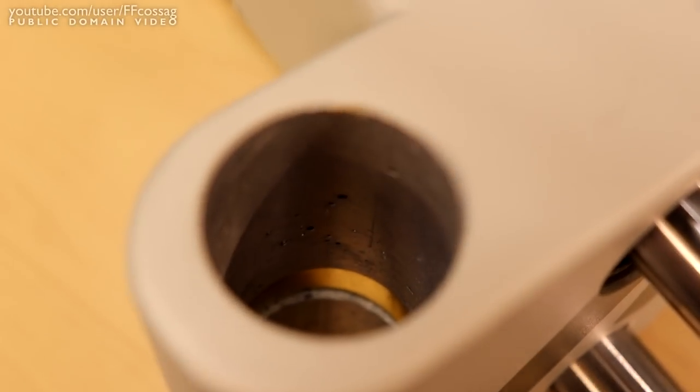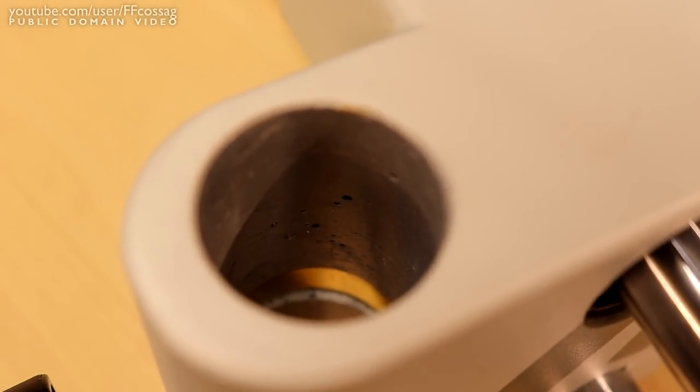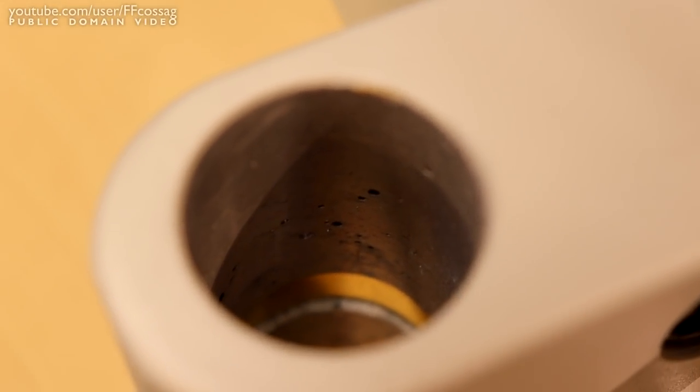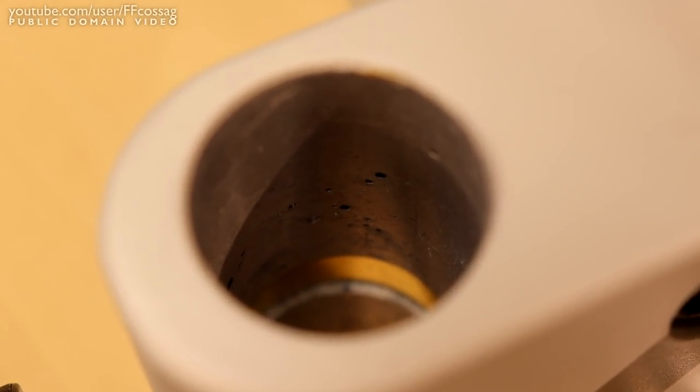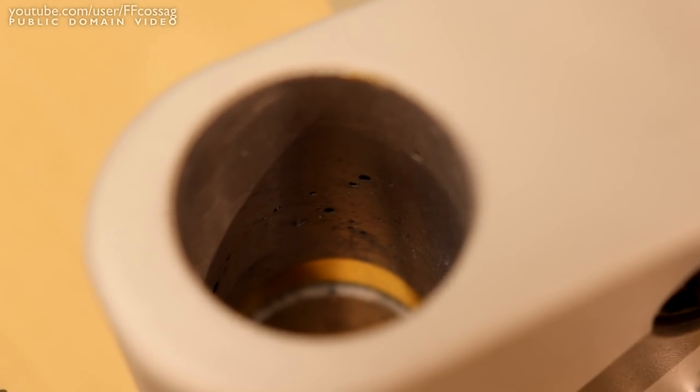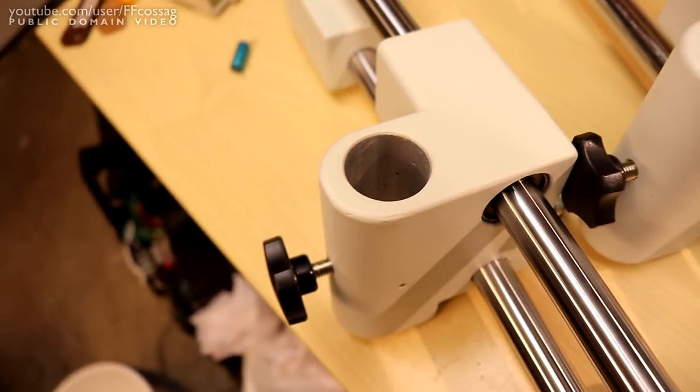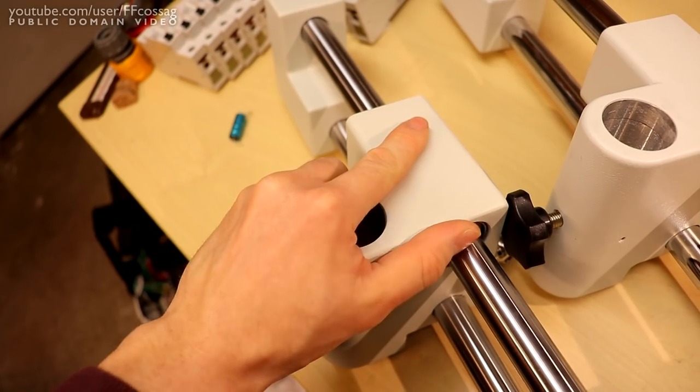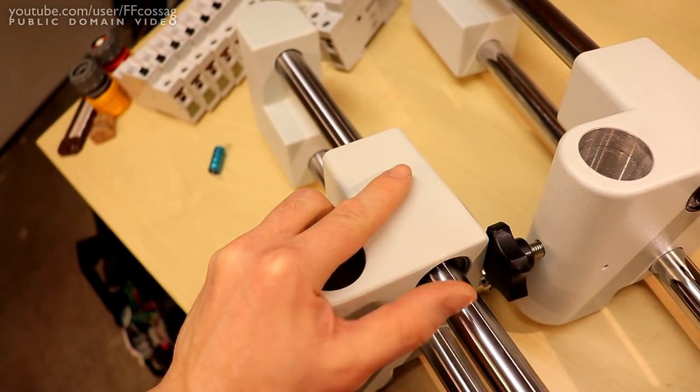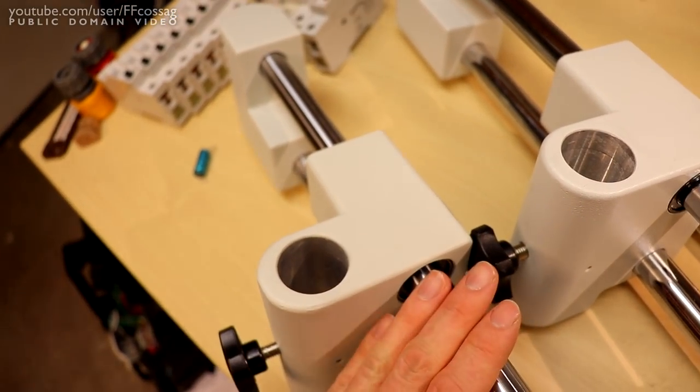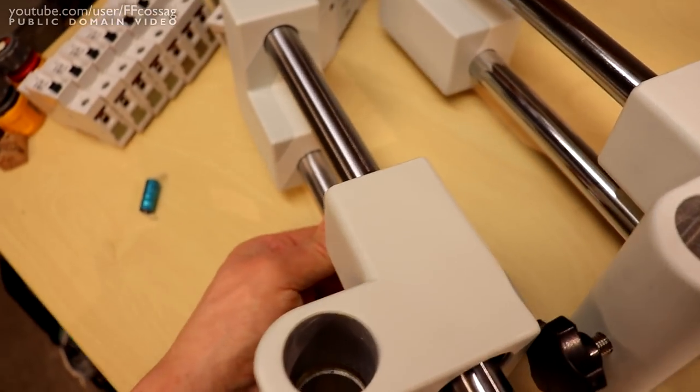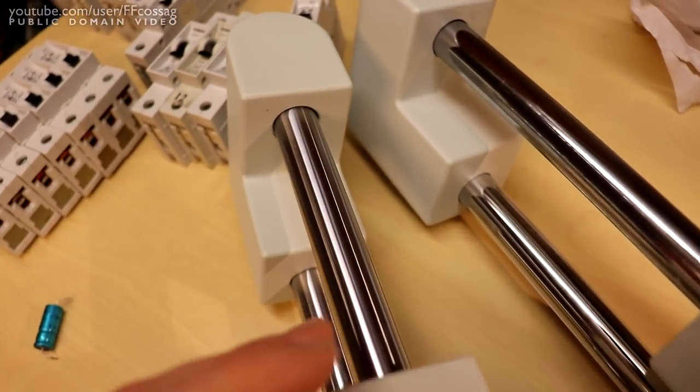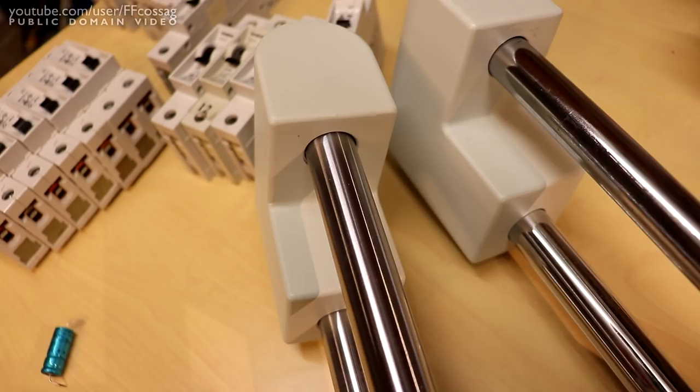However, the new one has seemingly inferior quality, because there's a bunch of holes in the actual casting there. That's either a manufacturing fluke or they're using lower quality material in these parts to make up for the higher cost of a hardened boom arm. I don't mind at all because the boom rod is a lot more important.